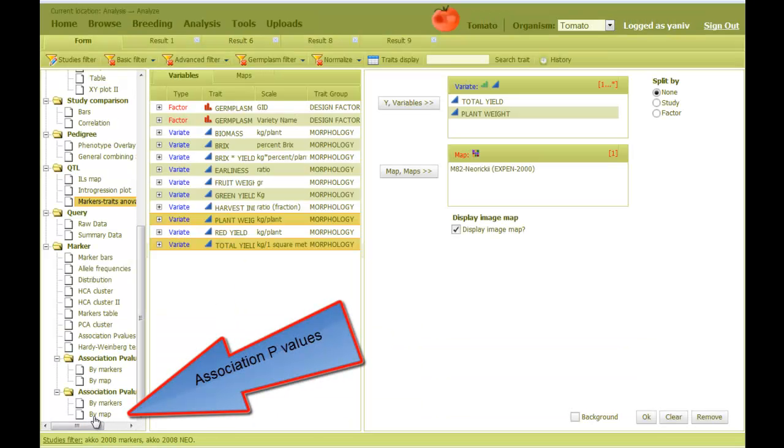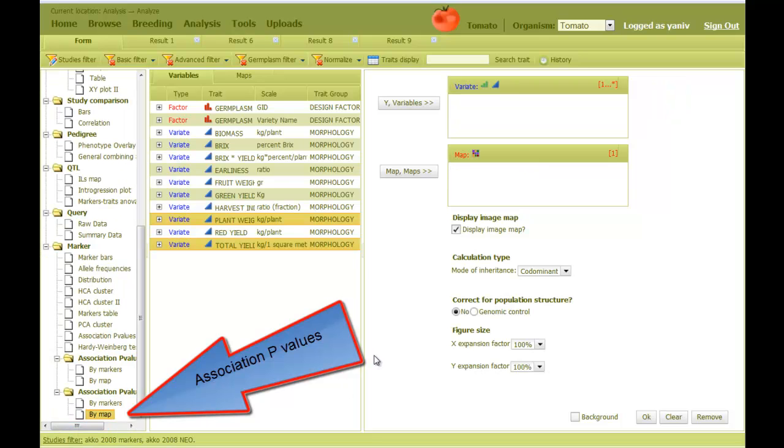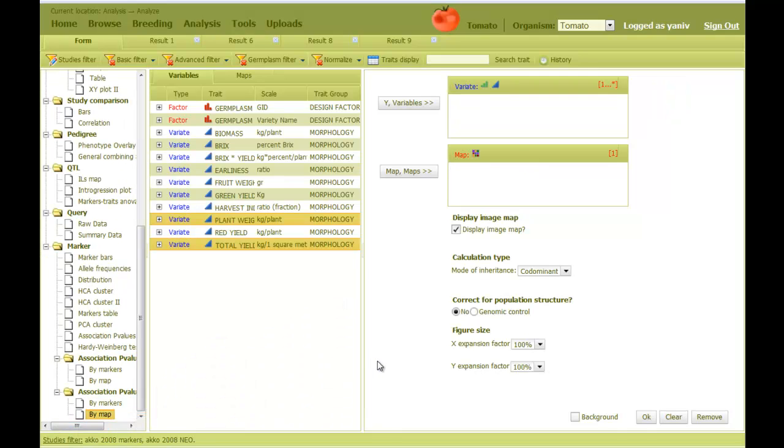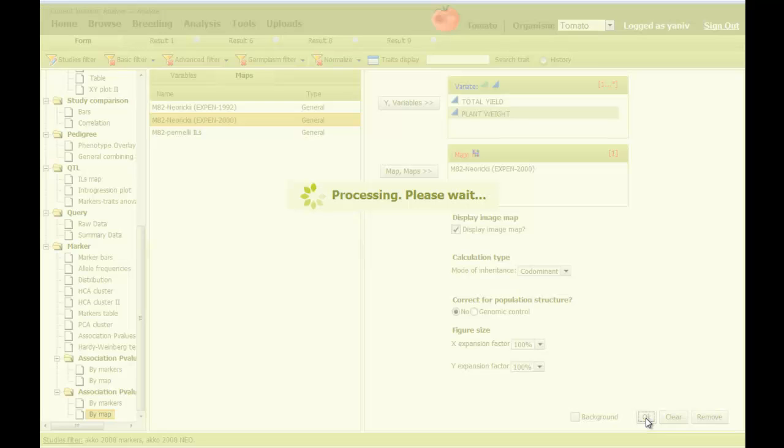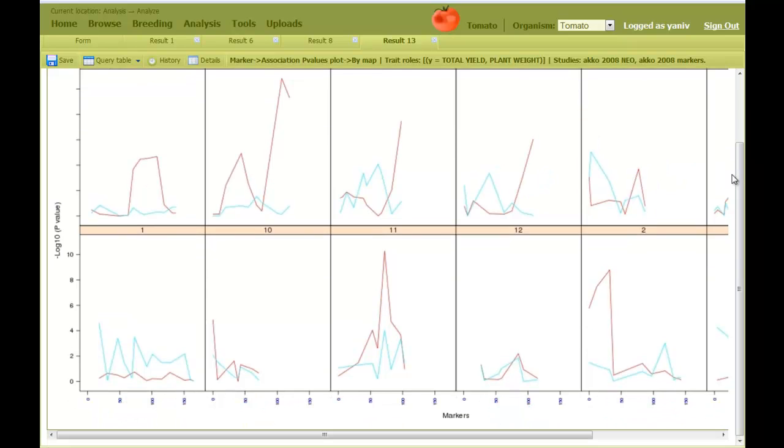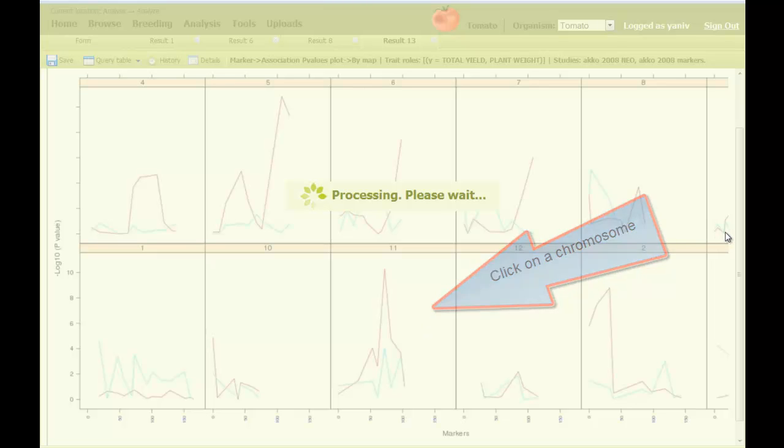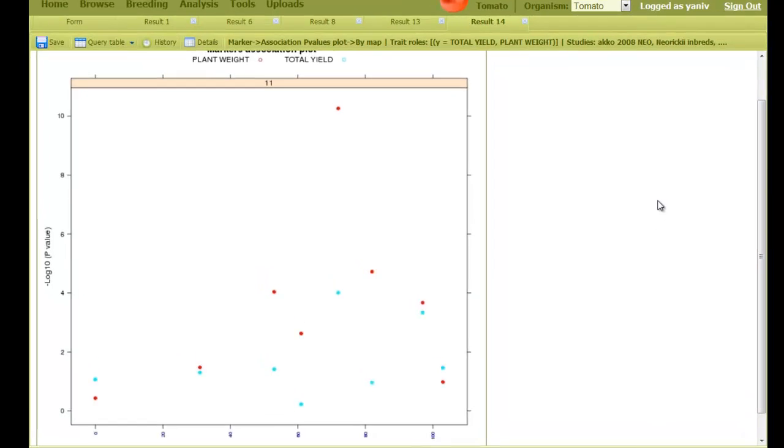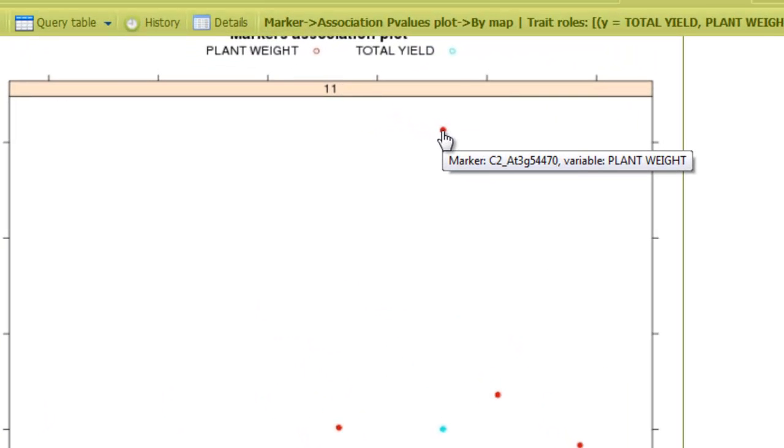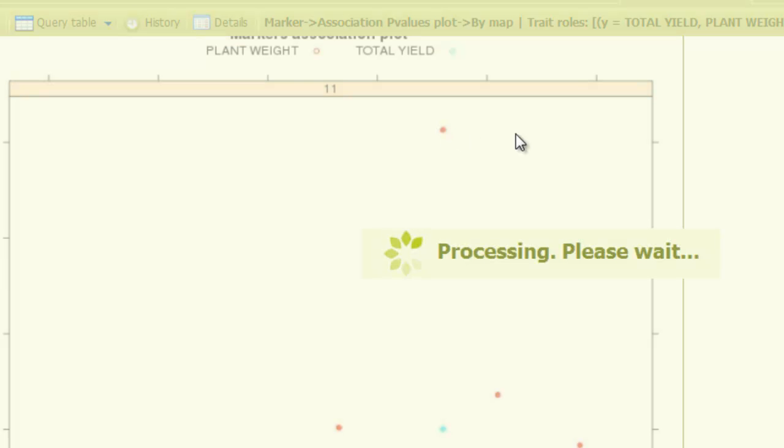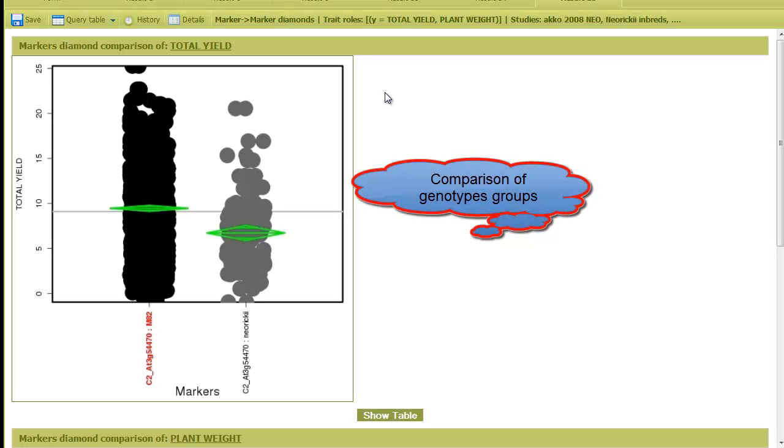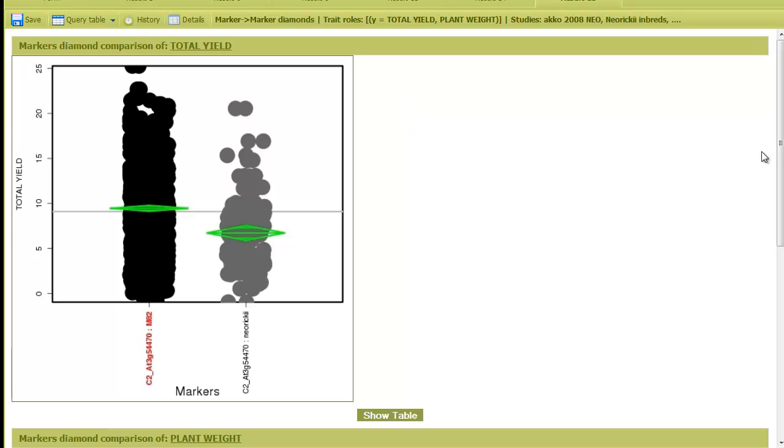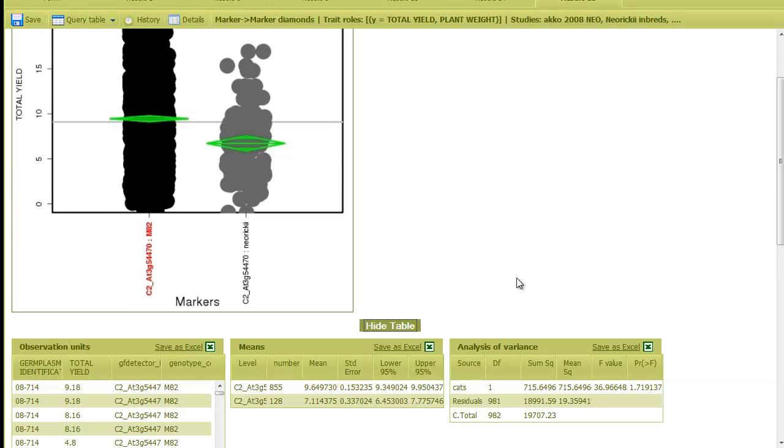The association p-values plot is similar to the previous analysis, only that it displays p-values instead of means along the chromosome. Here, the y-axis is the minus log of the p-value. Clicking on a panel will display the chromosome plot on a separate figure. Here, each data point represents the p-value of the corresponding marker and trait, as can be seen in the tool tip and the figure legend. Clicking on a point will display the actual comparison between the genotypes groups for this marker. And the analysis of variance table can be viewed.